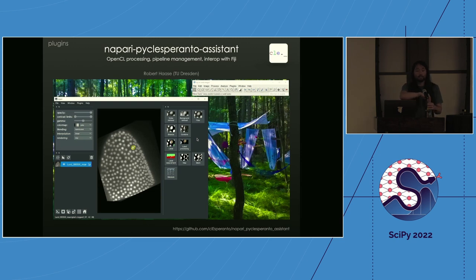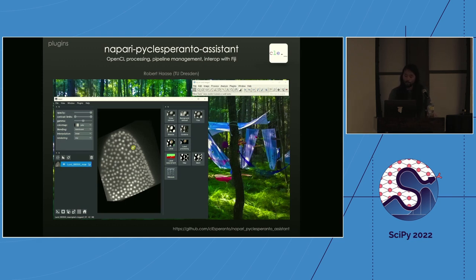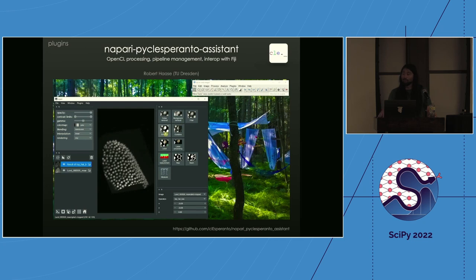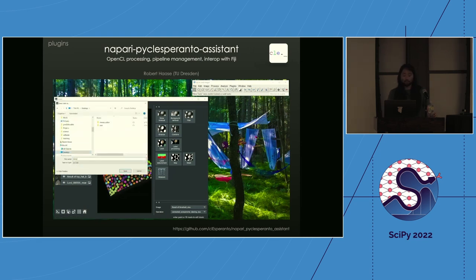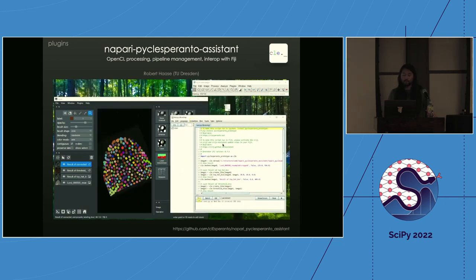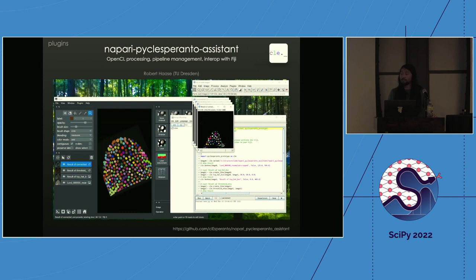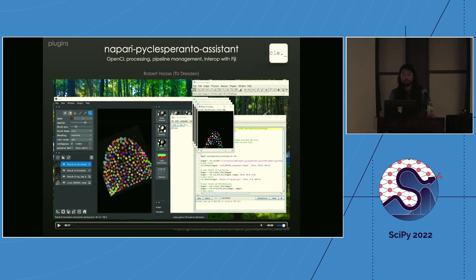Just to give you a sense of some existing plugins: the PyClASP (pyClesperanto) Assistant from Robert Haase in Dresden provides GPU-accelerated common image processing operations like filtering, counting, and measuring. It's written in OpenCL so it's cross-platform — you can run it on CPU and GPU. He's also written interoperability tools to export scripts that can be used in Fiji, a popular image processing toolbox in bioimage analysis.